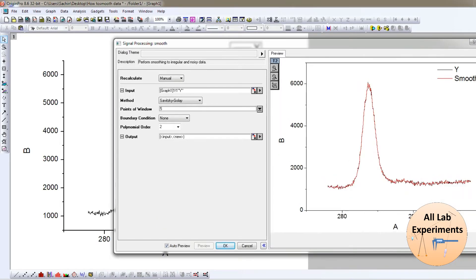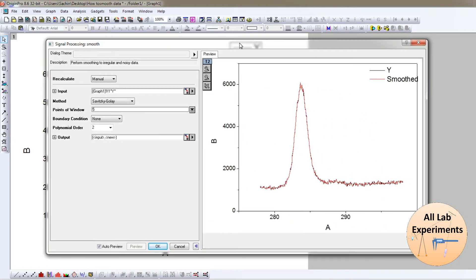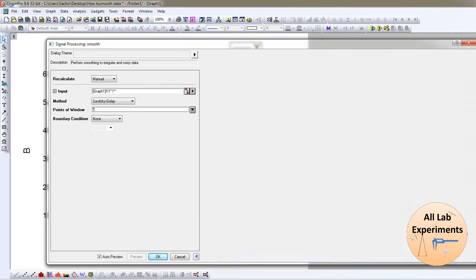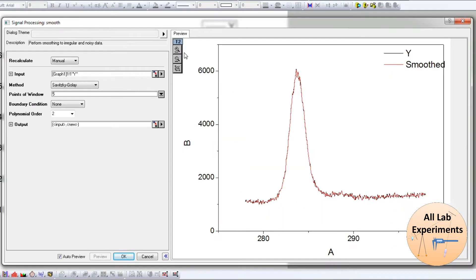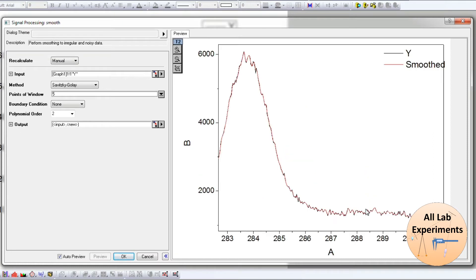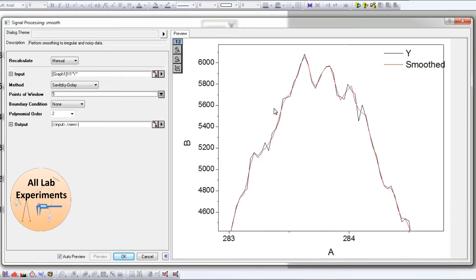To look at this graph and its smooth curve, we can click the auto preview option. Now I can increase its size so that we can look at it clearly. I am also zooming it.